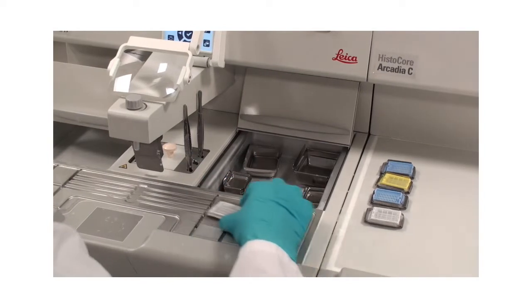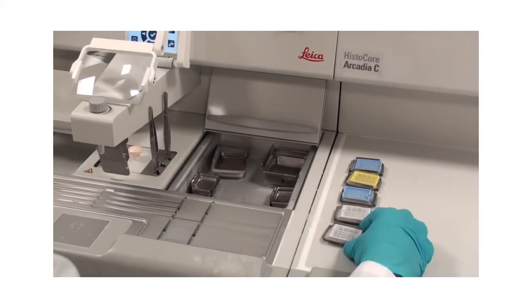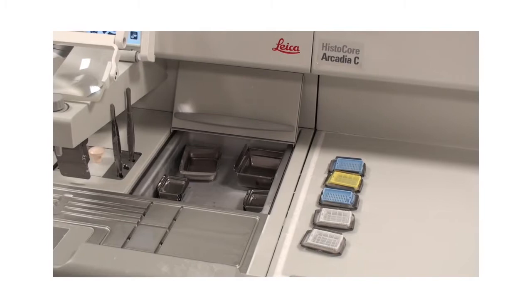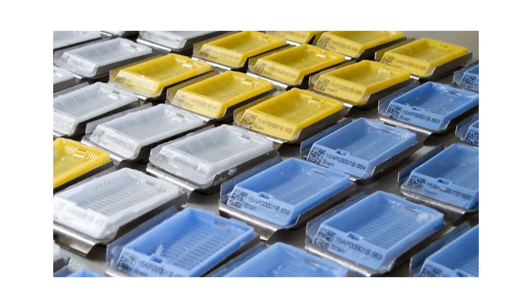Store your filled molds on the cooling plate of Arcadia C. The cold plate is held at a constant temperature of minus 6 degrees Celsius. The generously dimensioned cooling surface has room for around 60 blocks.